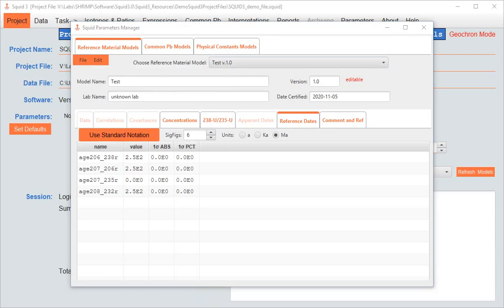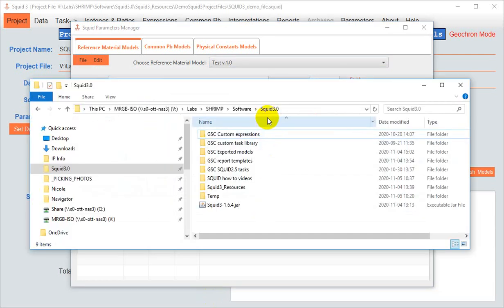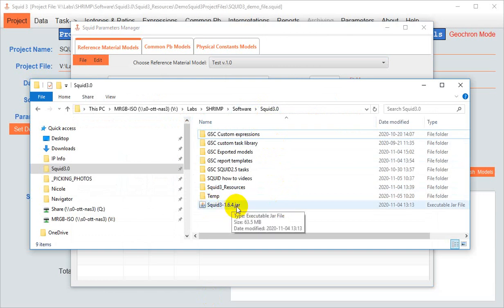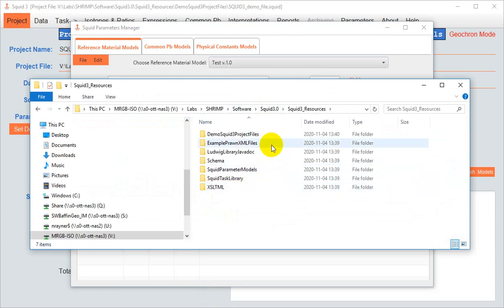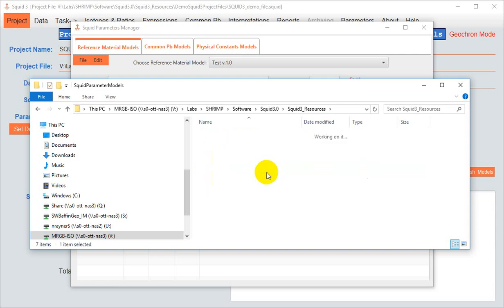Some of you might be quite observant, and notice, in the folder where your .squid.jar file lives, there's a folder called .squid.resources, and within that, a subfolder called .squid.parameterModels. Now, you might think, that's a great place. That's where I'm going to save my custom models.